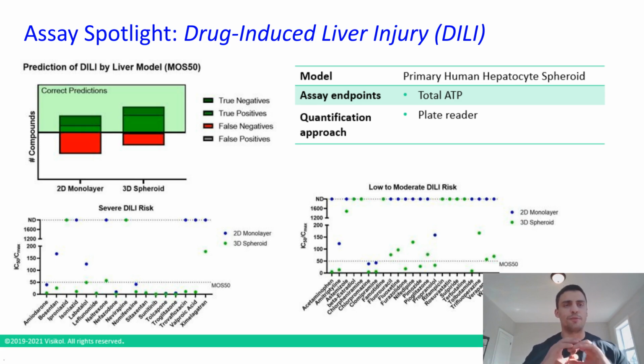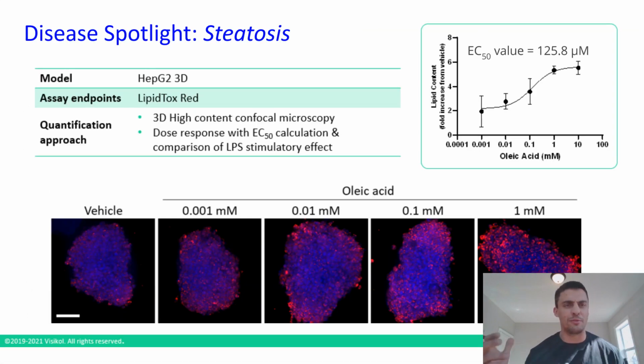So again, not great for all research questions. When we look at something like metabolism, we're not able to look at low clearance compounds. We're not able to have the same type of sensitivity in that respect that we do see here for DILI. So this is a really unique model for DILI, and it's also in a high throughput format, which makes it really ideal for screening large numbers of compounds. And when I say large, I mean several hundred compounds at a single time.